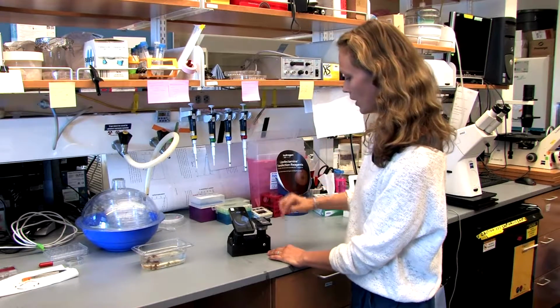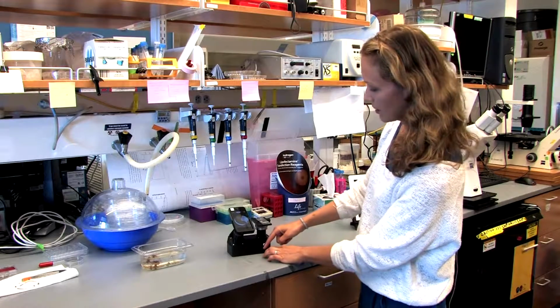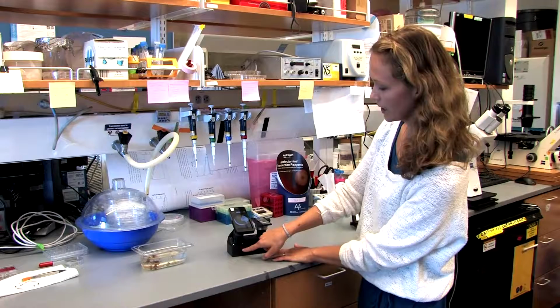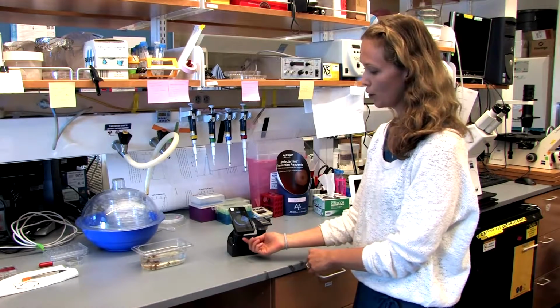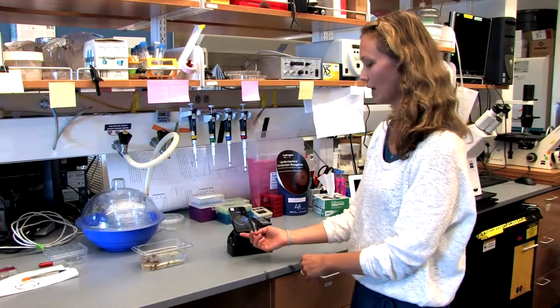It goes through the sample into the magnifying lens here. And the light then hits a mirror here and hits another mirror on this side and is directed up through what's called an eyepiece and goes directly into the camera of the iPhone in this case.